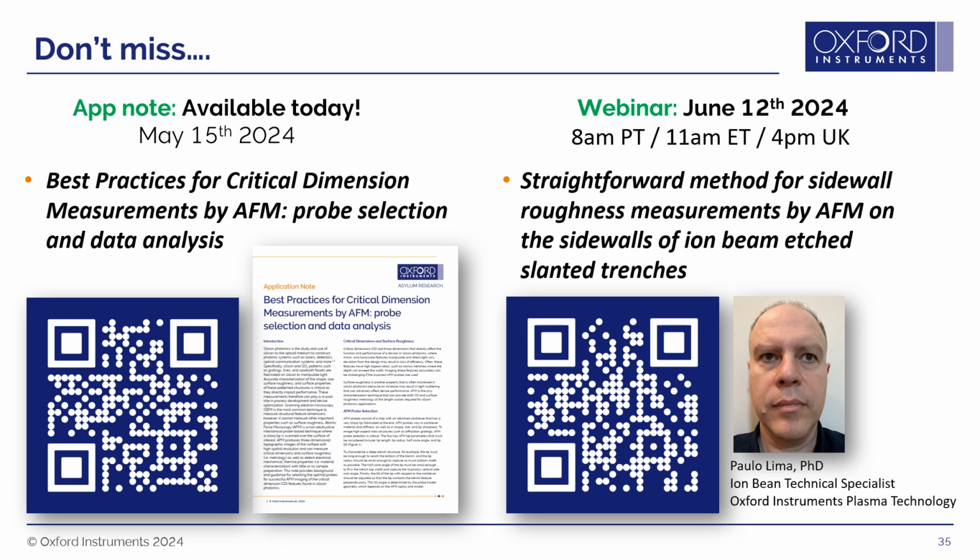In terms of values in nanometers, I don't have the values now, but you try to get them in the, I would say, hundreds of nanometers probably. You can as much as you can get from your cantilever. Usually you can try that.